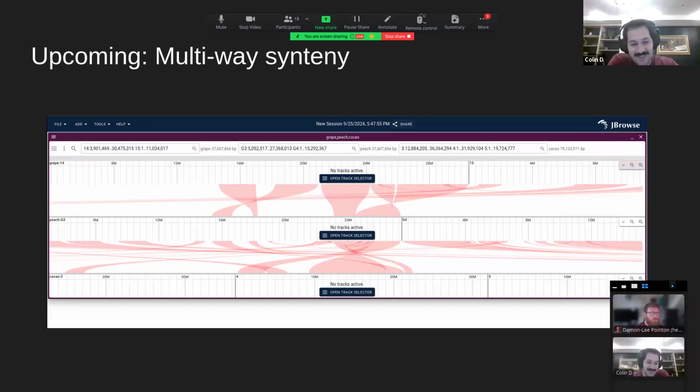So yeah, the other thing is running the latest version. Sometimes you get some surprising little bug fixes of that nature where things just get faster. But I will not say that your problem is probably automatically solved. So I would say there's strategies where maybe we need to pare down the set of visible regions to the ones that are larger than 1,000 bases.